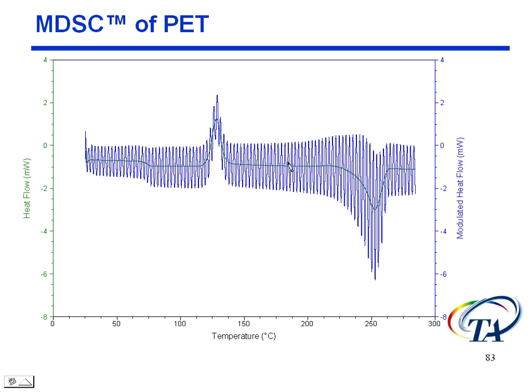The next thing I just want to point out here is if we look at the modulated heat flow data and the total heat flow data. Now remember earlier we went through how this was calculated. But in essence, it's going to be the average value here. There are some slight differences in the way we calculate it, but that's what the total heat flow data comes out to be.